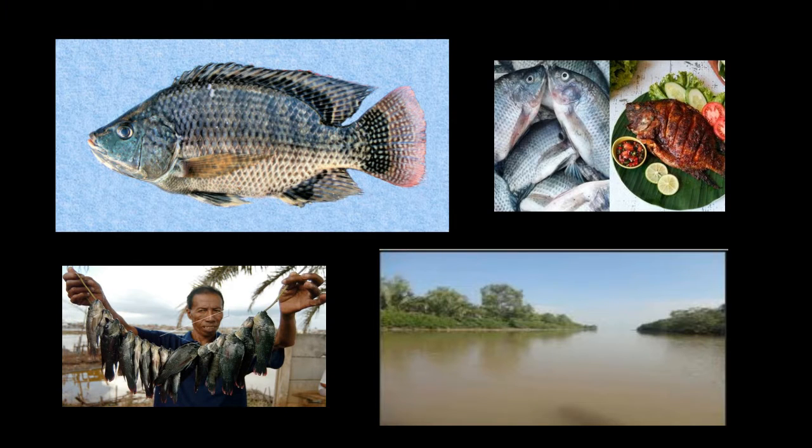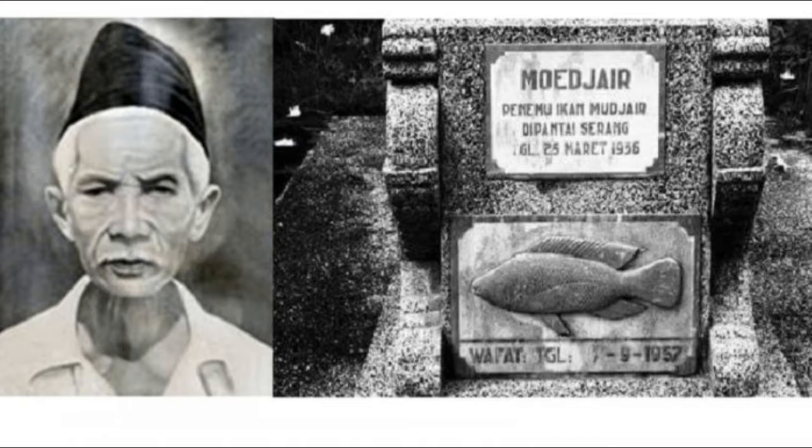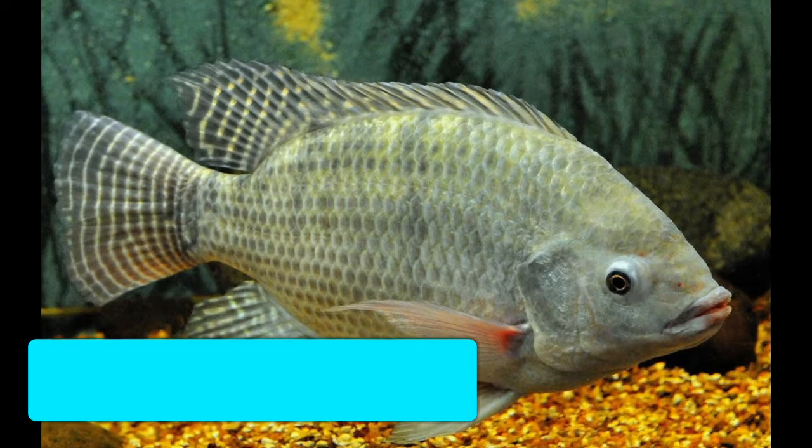You had better know general information about this tilapia fish. Mujair is a freshwater fish commonly consumed by Indonesian people. Tilapia fish have a great tolerance for salt levels or salinity, so they can live in brackish water. This type of fish has a relatively fast growth rate, but after adulthood, this speed will decrease. The natural distribution of this fish is African waters, and in Indonesia, it was first discovered by Pak Mujair at the mouth of the Serang River, south coast of Blitar, East Java, in 1939. This fish is closely related to Oreochromis niloticus, originating from Africa.